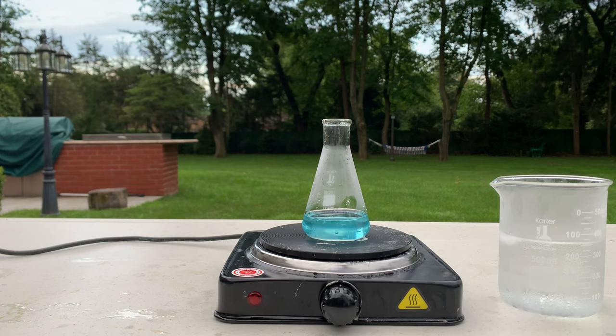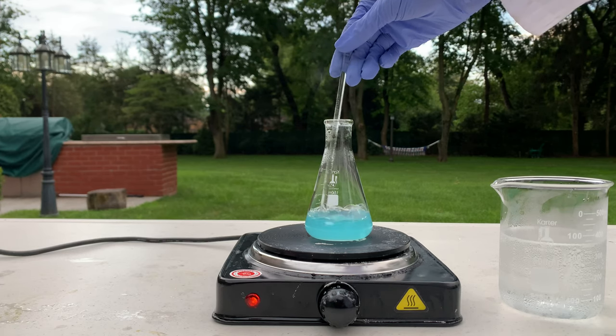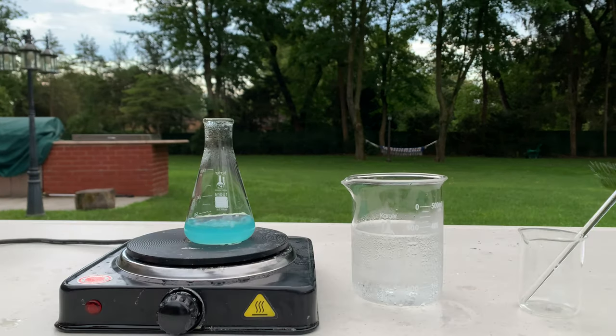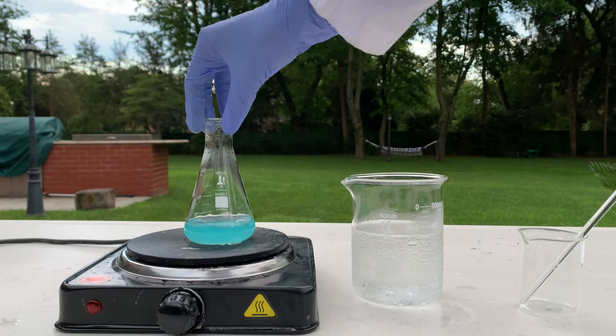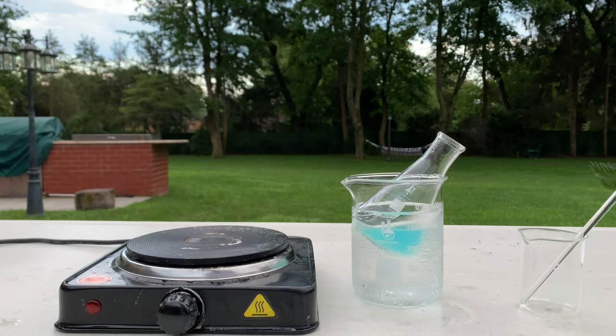If we don't get crystals, it's okay, because we still have the copper acetate and it looks pretty cool. The solution has finally reached a boil and we're going to let it boil down until there's just a little bit of liquid left. After boiling on the hot plate for a bit, I'm going to quickly cool it off by putting it in an ice bath and then run it through some filter paper to see if we can get any crystals.